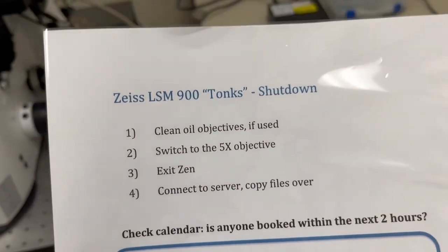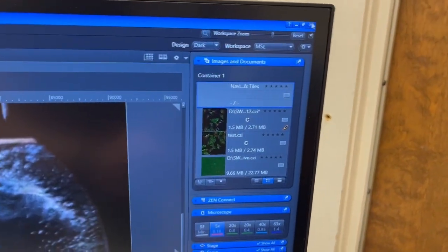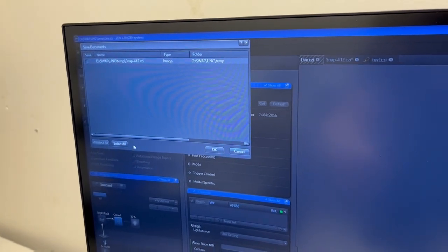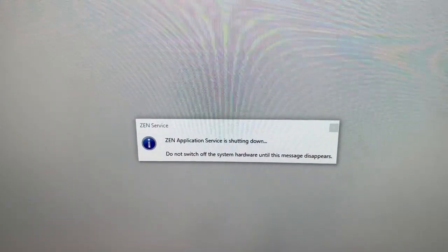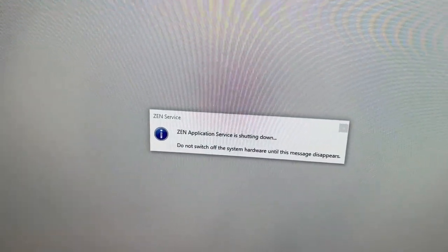The next step is to exit Xen. To exit Xen, we're going to go to the top right and hit the X. When we exit Xen, it's going to ask us whether we want to save things. Typically the answer is no. And if we have files that we haven't saved and we don't want to save them, we can just say unselect all and OK. Xen will close, and as it's closing you will see a message that says do not switch off system hardware until this message disappears. Please follow that instruction — do not switch off the system hardware until that message disappears.